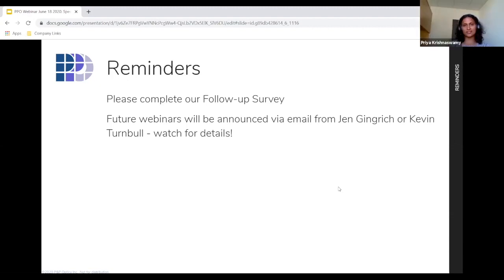Sure, Heather, that's a very good question, because when we talk about a spectrometer, it has so many building blocks. We are talking about the camera that goes into a spectrometer, then there is a spectral range that we have to fit, and then there's the point where you take an image and look at the spectral range, and then you have the lights, and the lights and the spectrometer assembled together in a system.